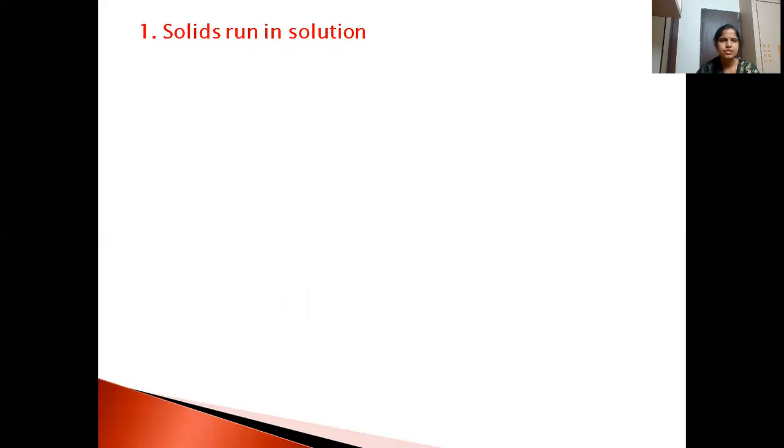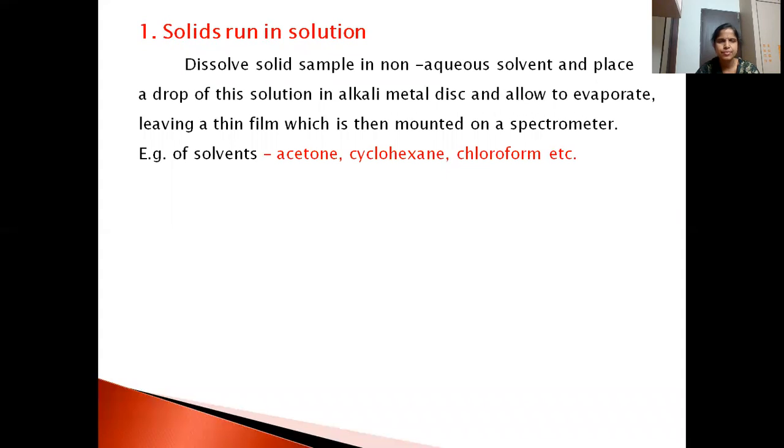The solid we are taking as a sample, we dissolve in a non-aqueous solvent, and place just a drop onto an alkali metal disc and leave it for some time.